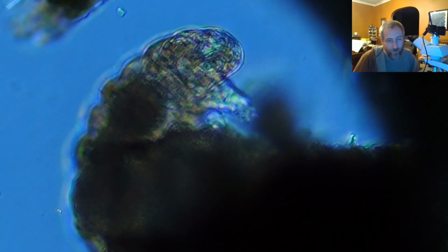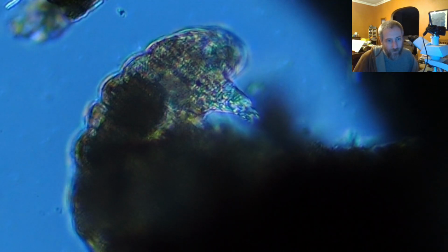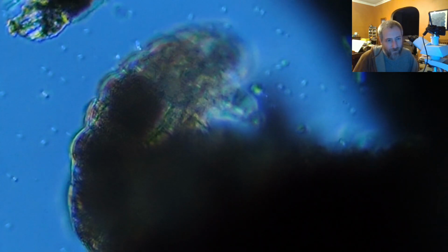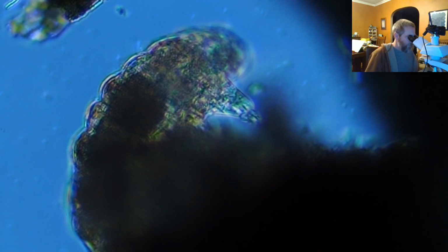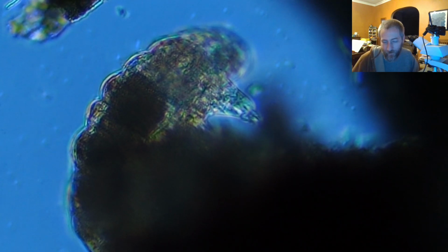And of course, unfortunately, it's not looking at us, it's looking away, but this one's not super active, and I don't know if those are eggs inside of it right there or what's going on inside of its body. It looks like maybe those could be eggs. They store the eggs inside their body like that.